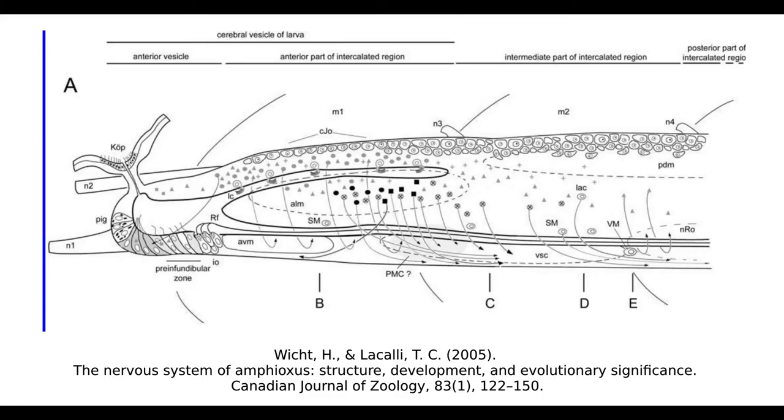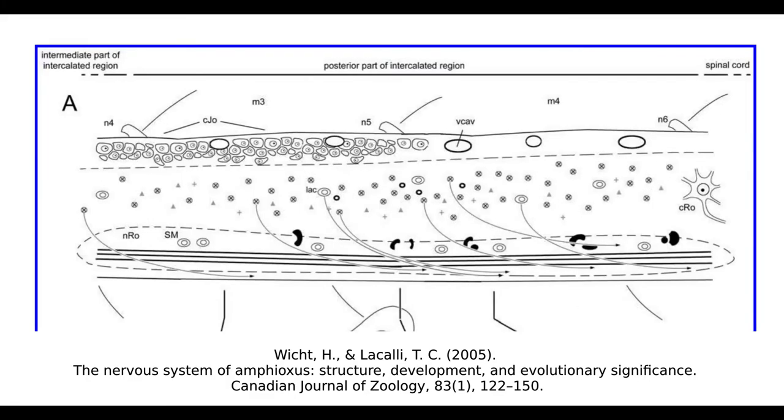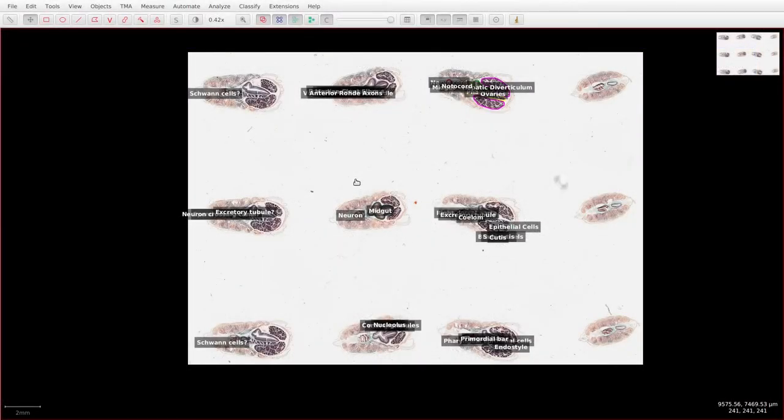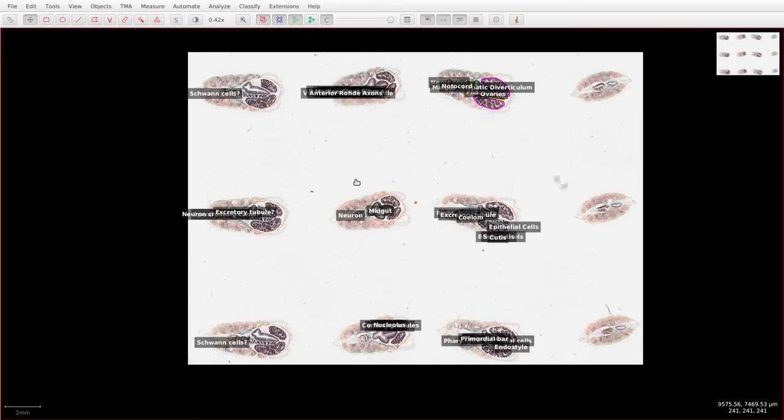However, microscopically and functionally, the dorsal spinal cord is very different all the way along its length. In order to try and work out which bits are which on the slide, I've had to look at several different papers and piece together a brief overall look at the anatomy. However, you shouldn't underestimate the complexity of the nervous system of an amphioxus, and if you'd like more information you can go to the original sources.